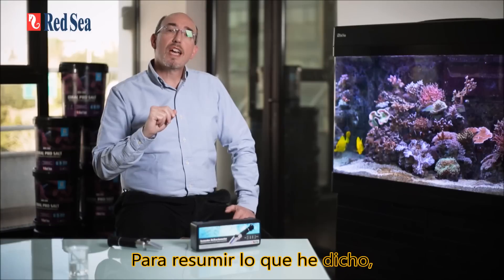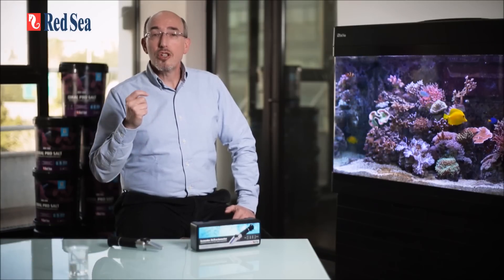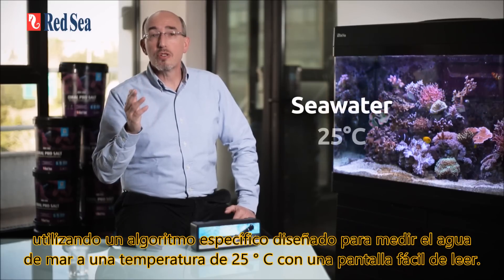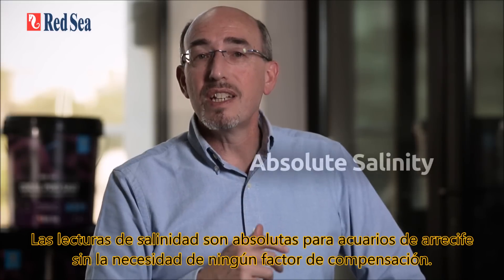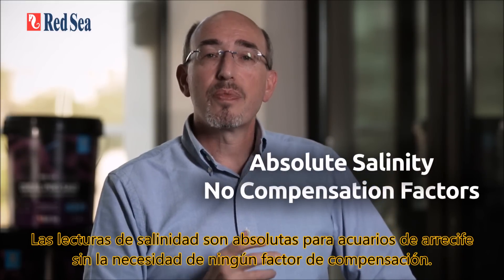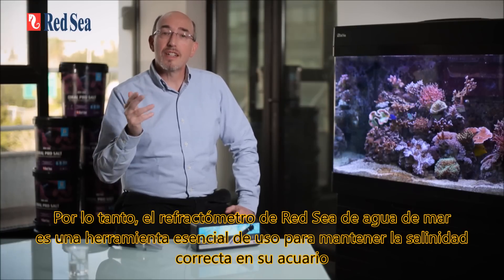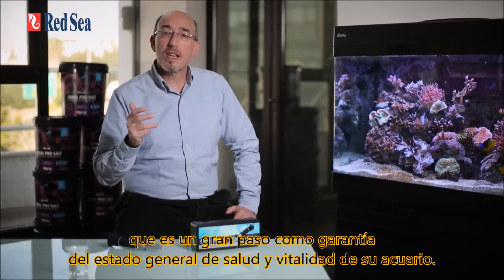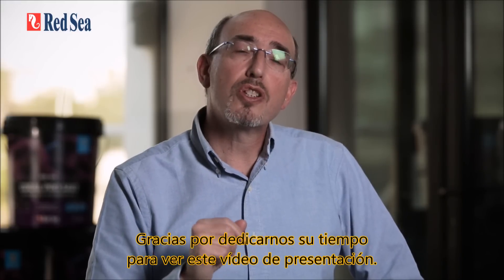To summarize: Red Sea's refractometer offers exceptional accuracy using a specific algorithm designed for measuring seawater at 25 degrees C, with an easy-to-read display. The salinity readings are absolute for reef aquariums without the need for any compensation factors. Red Sea's seawater refractometer is therefore a user-friendly and essential tool for maintaining the correct salinity in your aquarium, which is a big step in guaranteeing its overall health and vitality.